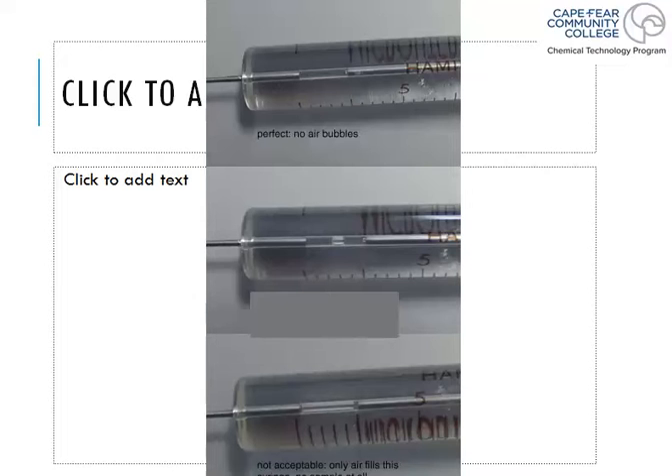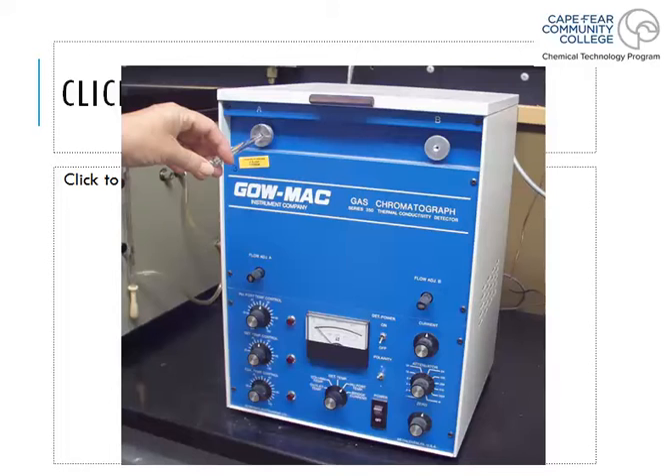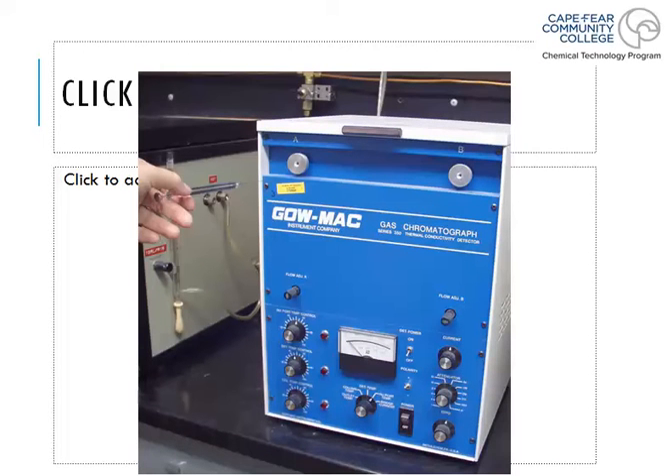After filling to the proper amount, go to the GC system — this is a Gow-Mac; we have some in the lab but don't use them much anymore. There's the injector port front and center. When you push the sample in, you want to be very quick about it — not slow. Put the syringe in, squirt the sample all in at one time, and then quickly pull the syringe out in one very fluid motion. Being jagged or slow pulling it out could allow your sample to escape the injector port.